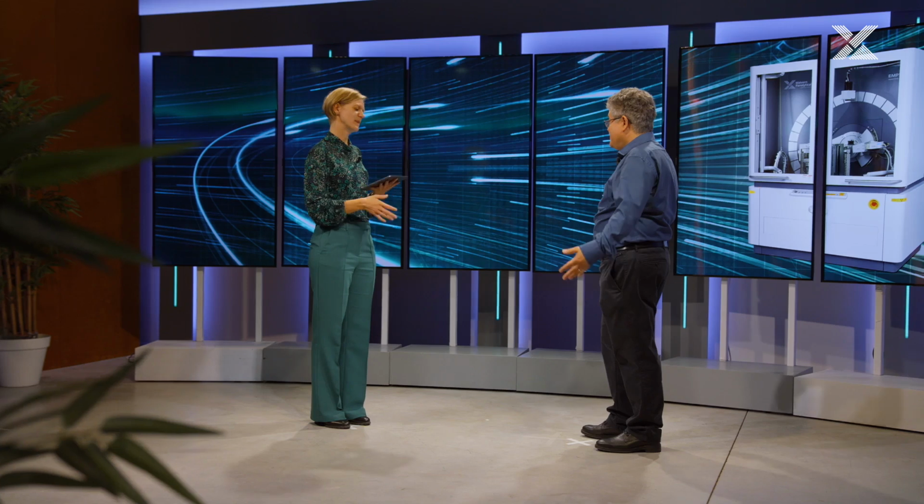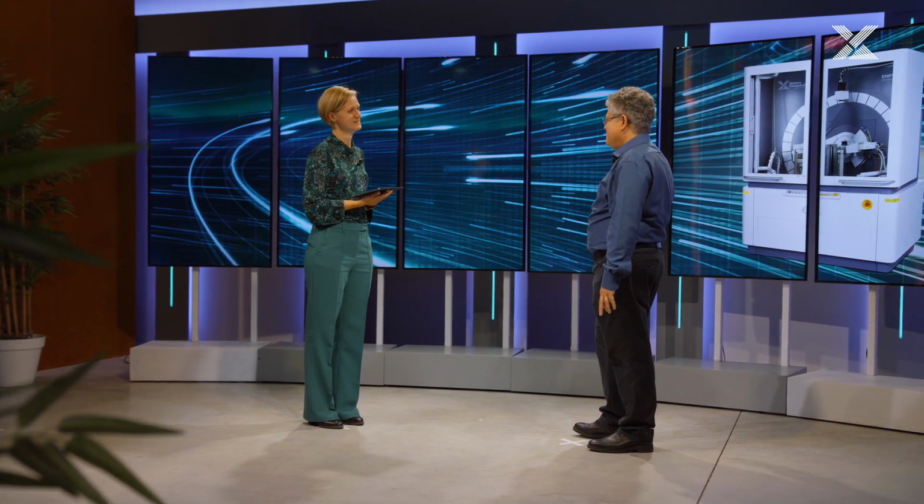But explain, what's the technology about? Well, basically, it's the technique that I like to say Konrad Röntgen almost invented. One of the first images is the one of his wife and the ring finger. And if he had rotated her hand a little bit, collected lots of images and had figured out how to reconstruct the 3D images, he would have invented computed tomography at the same time. But he was way ahead of his time, right? Well, he would have been very much ahead of his time.